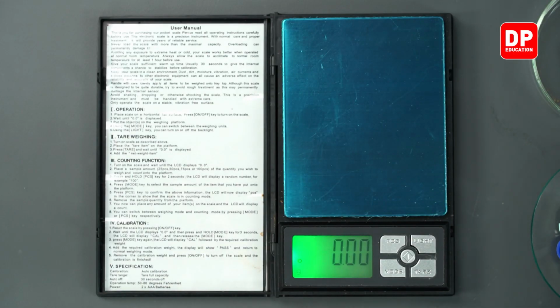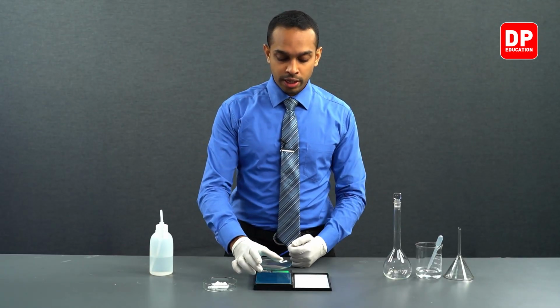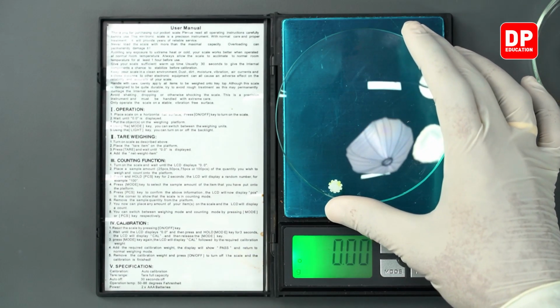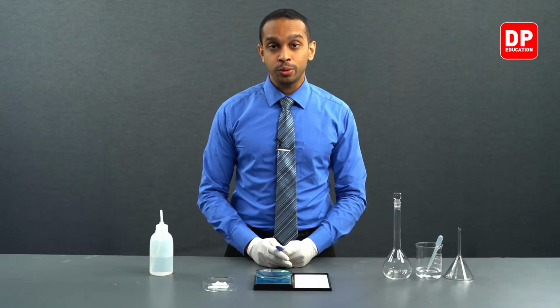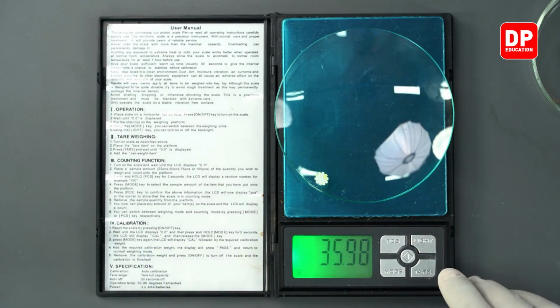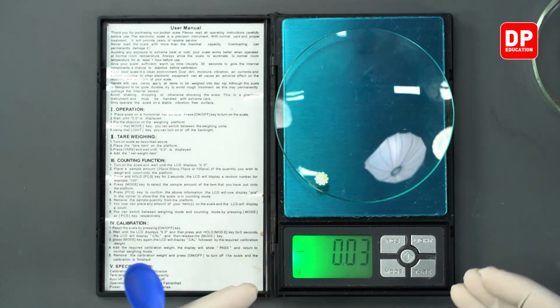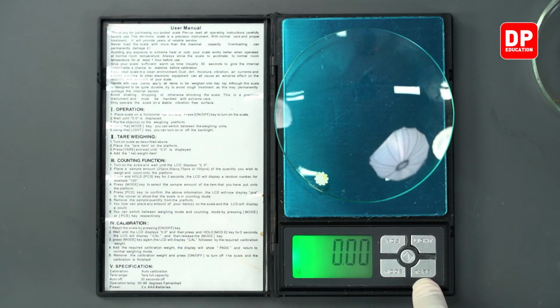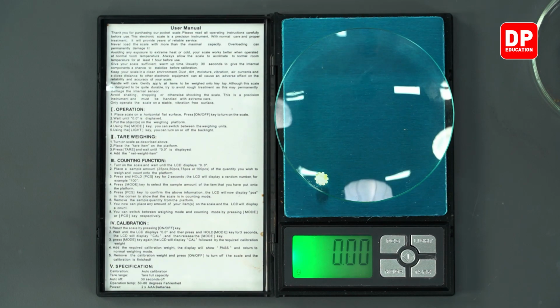We will turn on the digital balance we have here, and we will use a watch glass to measure the potassium oxalate. So we will place the watch glass over here. We actually do not need to know the mass of the watch glass because since we are using a digital balance, we have the option of removing that weight by using the tare function over here. Now the mass of the watch glass is disregarded.